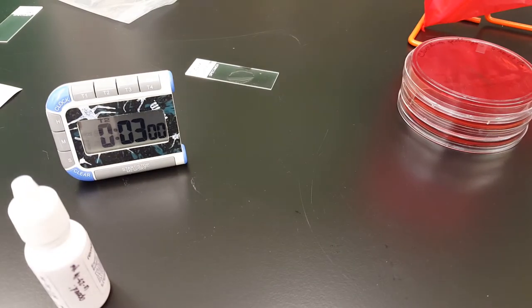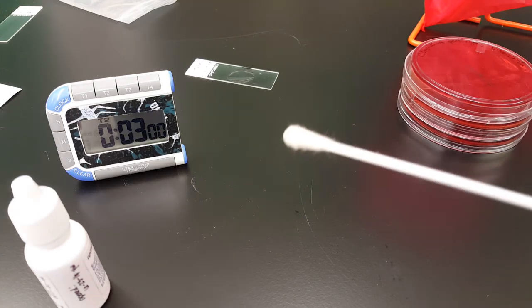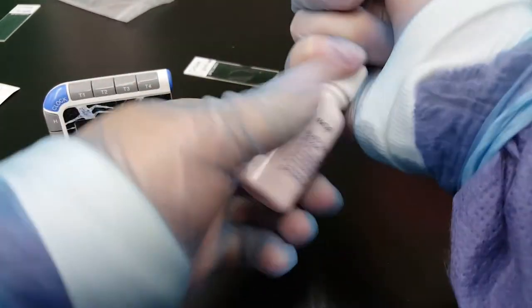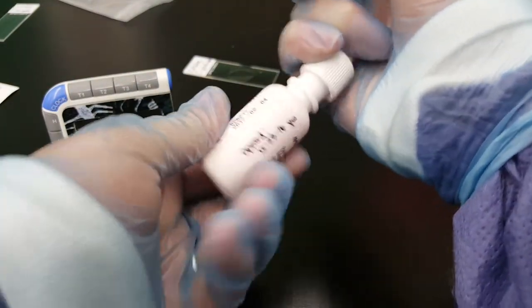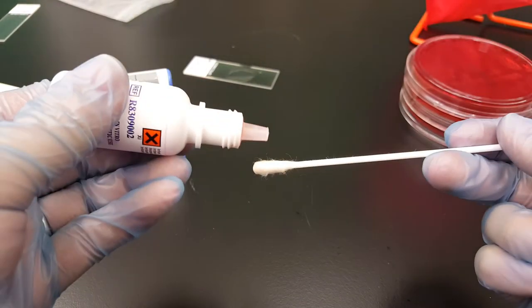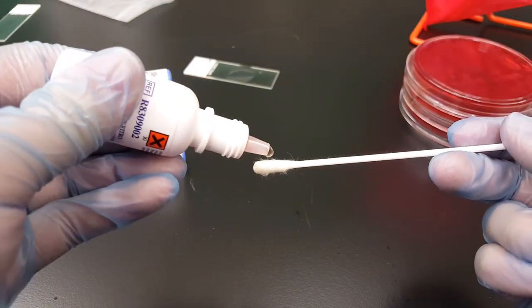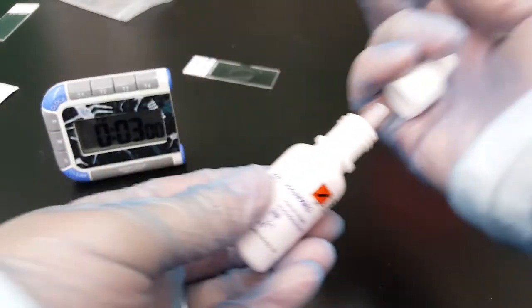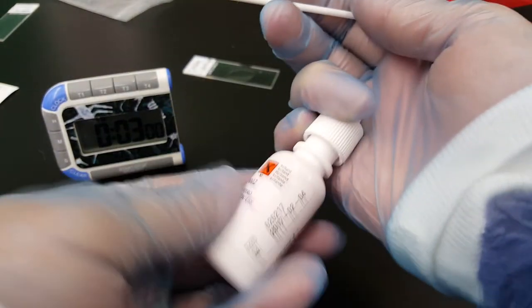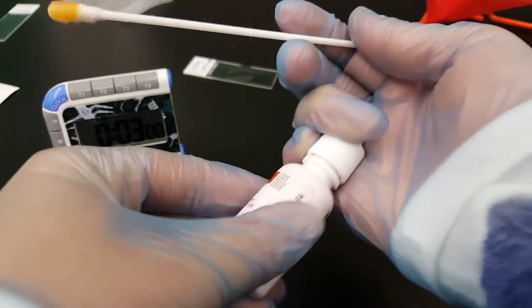Now we're going to do the indole. So we have our swab that we're getting ready. And we're going to put two to three drops of the spot indole reagent on there. So we can just touch the colony and look for a color change after one to three minutes.